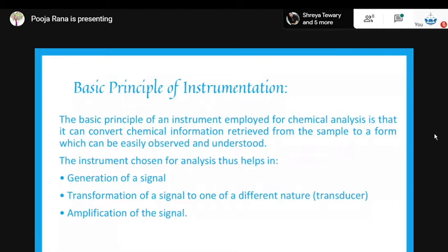So these are some of the trace evidences, as I was talking about, extrapolation of the report which we are getting, extrapolating it to a larger scale. For example, you have trace evidences like pollen grain, which is not visible by the naked eye, so obviously we are going to analyze it using the microscope.